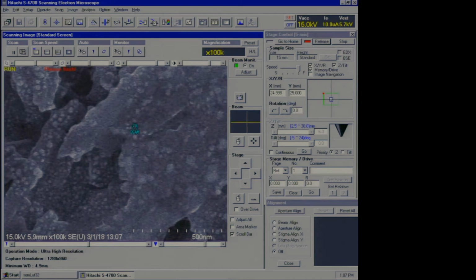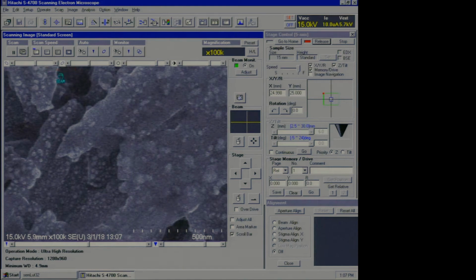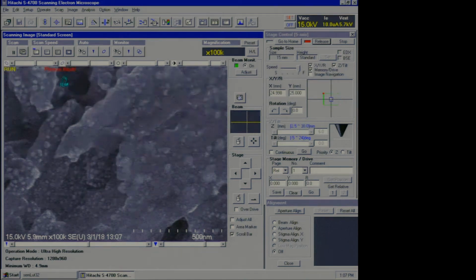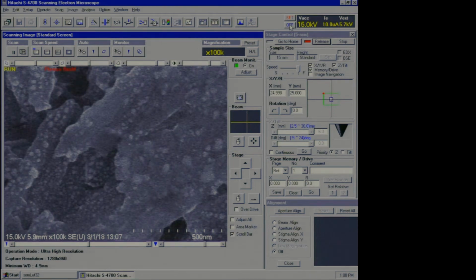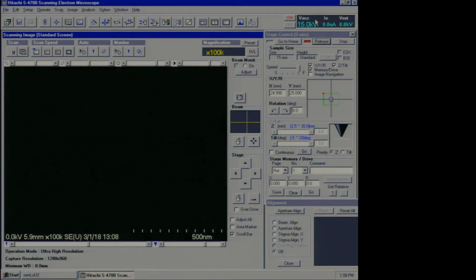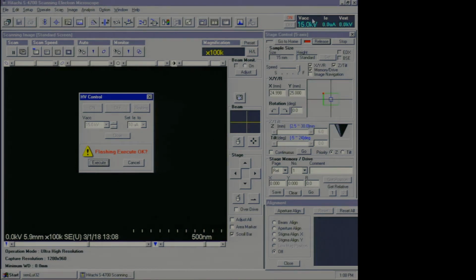While you're using the tool, you may get the please flash warning sign, as you can see here in red. If this happens when you're using the tool, you first need to turn off the high voltage. Then right click on the high voltage control panel, click on flashing, and then simply hit execute. Note that the flashing will appear here, and then there will be a momentary flash current here. You need to write that flash current down in the log sheet.